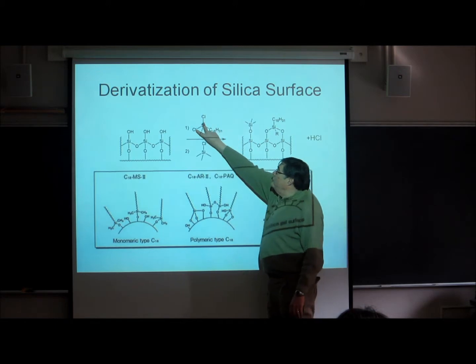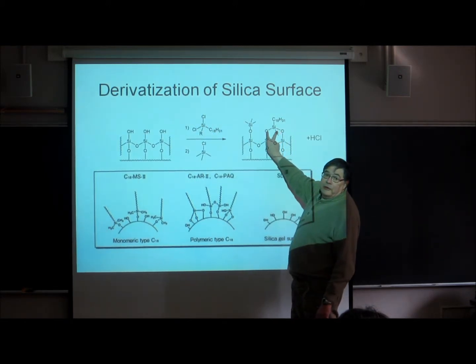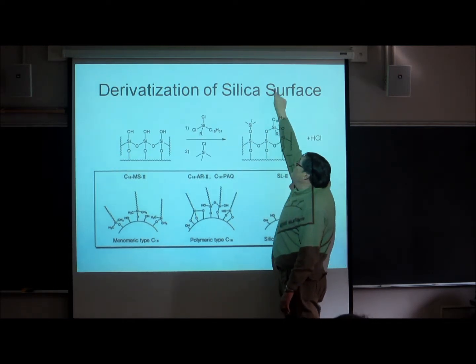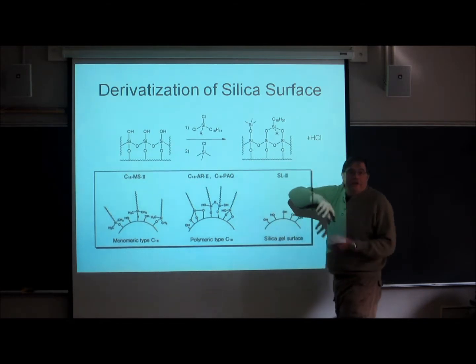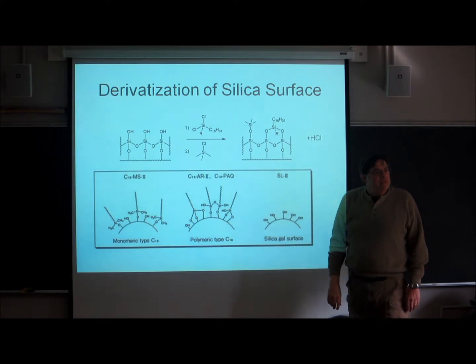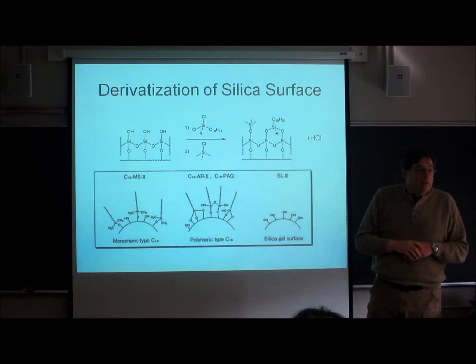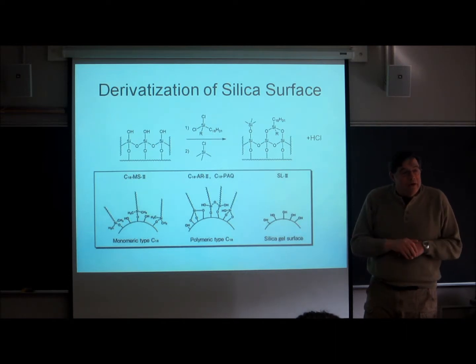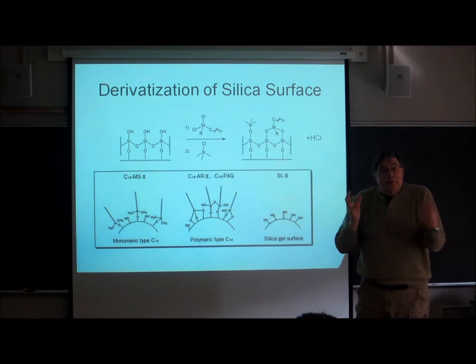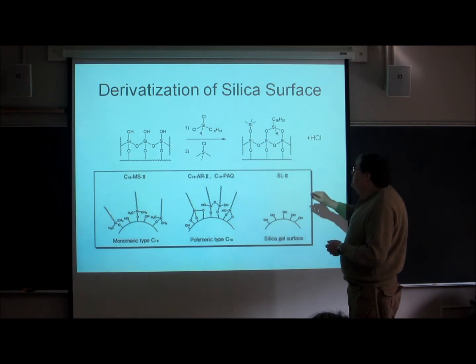And this one has 2 chlorines on it, and that'll sometimes produce these bridging structures like this. And then you see the C18, we don't show it extended, but in your mind's eye, it extends up like a long tail. And that's a very oily group, right? It's like diesel fuel, long alkane, and it has low polarity. It can be polarized because, depending on what you bring up close to it, you can make electrons move away or move toward. Not terrifically polarizable, but still pretty polarizable.